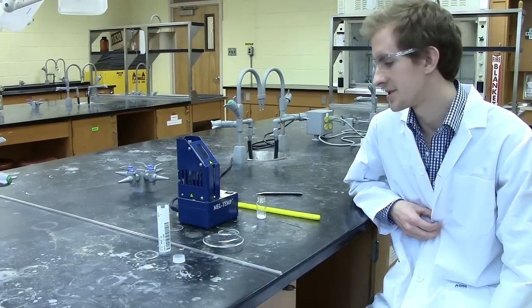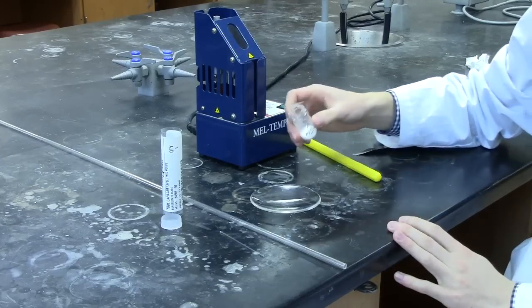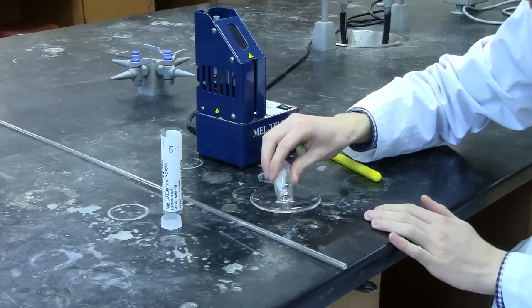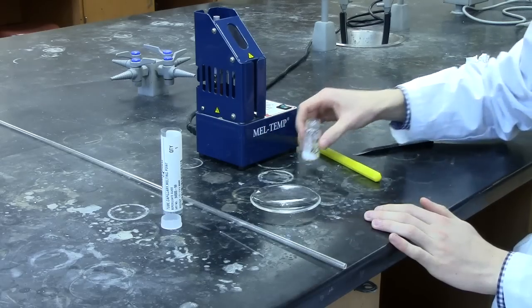In our lab for measuring melt temperatures we use the Mel-Temp. To prepare your sample, you'll be using a watch glass and putting a very small amount of your desired sample onto the watch glass.